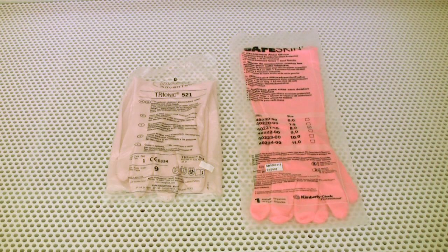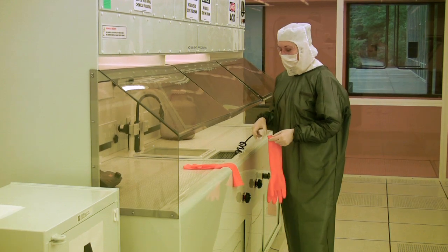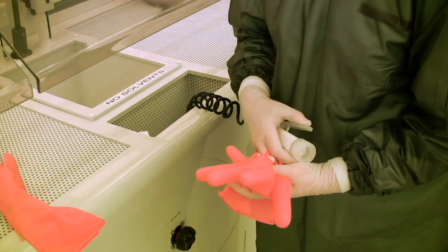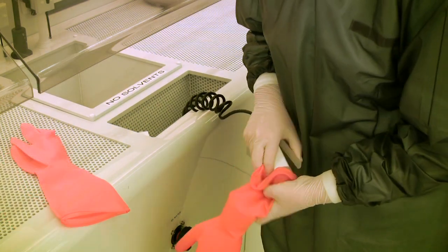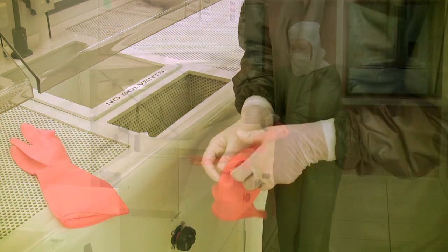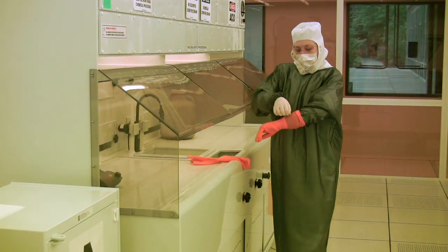Once you put the apron on, the next items to put on will be the acid gloves. Each pair of gloves are individually wrapped and are one-time use, meaning that you will dispose of them when you are done working in the fume hood or handling chemicals. These gloves are intended to be worn over the standard nitrile cleanroom gloves and are the only gloves you should use when handling acids or bases. Prior to putting the gloves on, you should inspect them for leaks by inflating each glove with the nitrogen gun located on the front of the wet bench. If you are confident that there are no leaks, you may put them on.